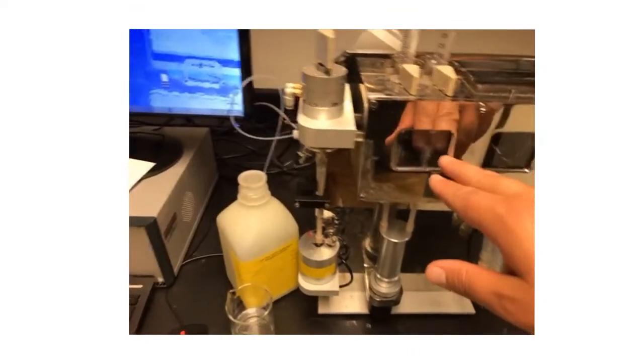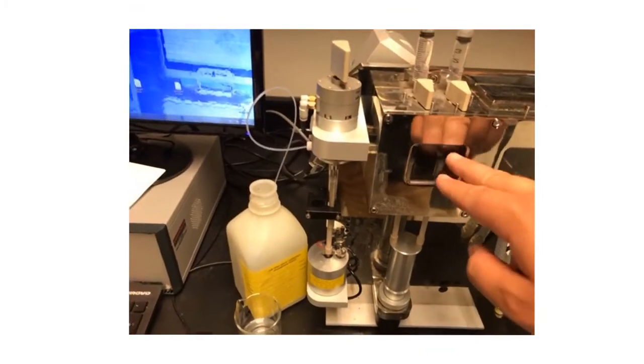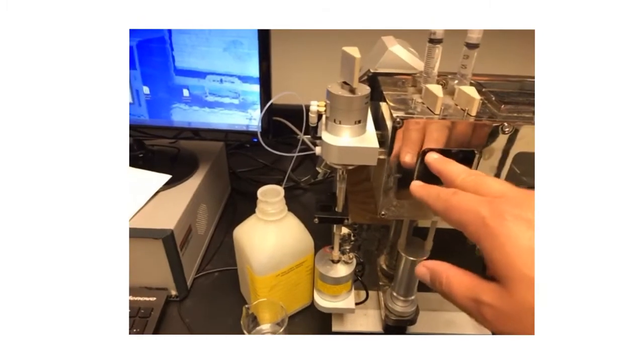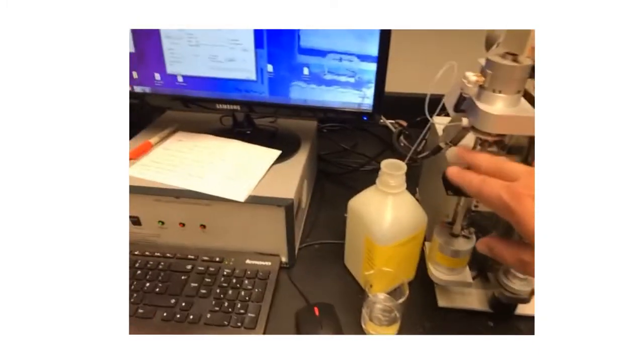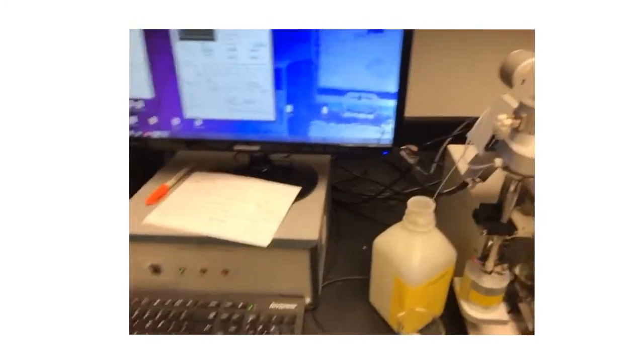And then one of the things that you'll notice if you, like in our experiment, when we do this in lab, we'll have like a yellowish color here and a clear color here. Then they'll take about two of those processes to see kind of like the mixed yellow color over here.